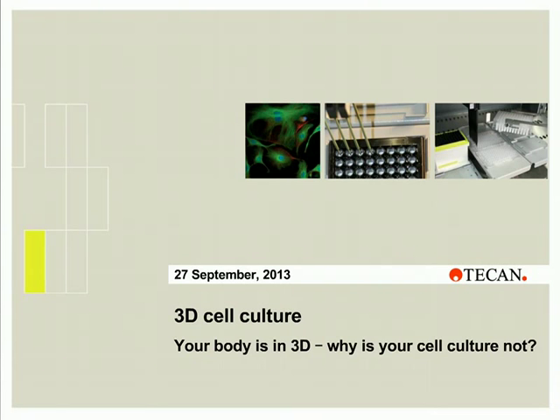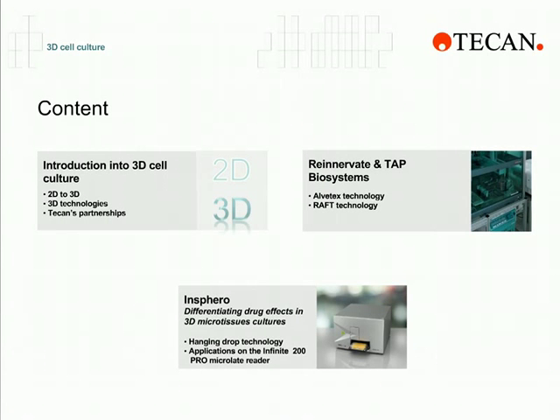So thanks very much, Ashley, for that very kind introduction, and a warm welcome to the audience also from my side. Together with my dear colleague Jens from InSphero, I will share some information and data about 3D cell culture today. So first of all, I will start with an introduction on 3D cell culture, explaining the benefits of 3D cell biology compared to conventional cell culture technologies, so 2D cell culture. Then I will quickly explain the major technologies on 3D cell biology, so how can we realize three-dimensional growth of cells. And then I will also talk about the activities of Tecan related to that very hot topic.